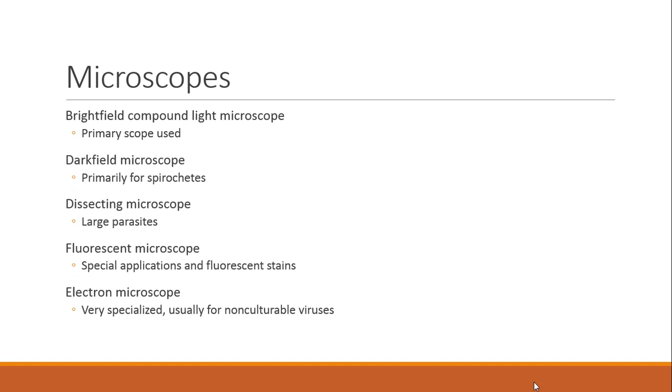All right. These are the different types of microscopes. We use the compound microscope.